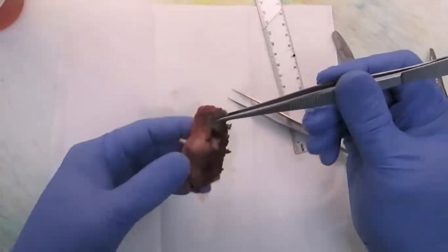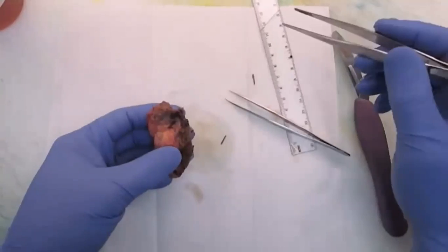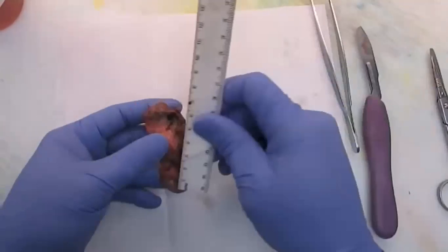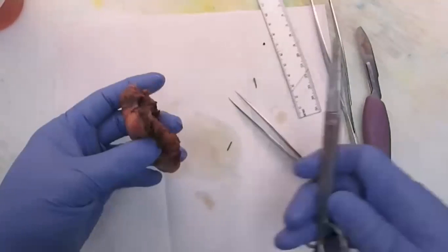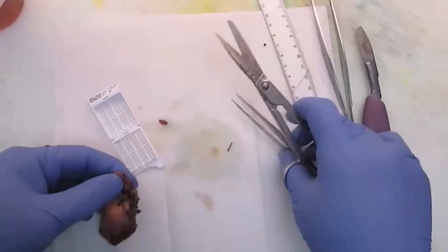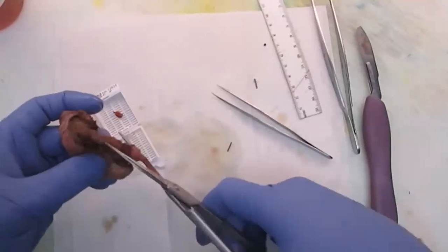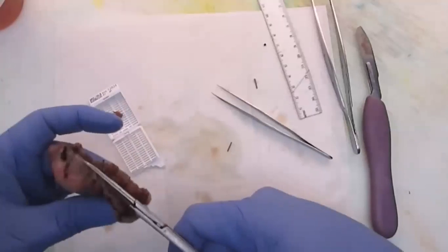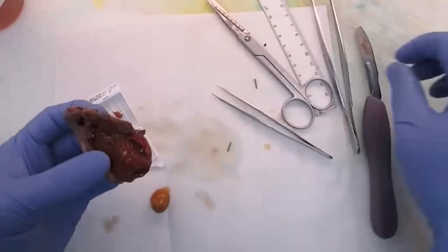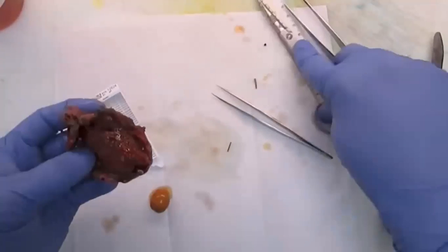So now I'm going to just start dictating it, and I'll cut it open, and then we'll continue with the inside. Specimen A, received in formalin labeled gallbladder, is an intact gallbladder. So while the doctor is examining the specimen, actually naka-record na siya. Nire-record niya yung sarili niya, so that after that, he can review that and transcribe, no? What he said while performing the gross examination. So if there is an abnormal structure found in the specimen, I also have to indicate that and also inspect it.